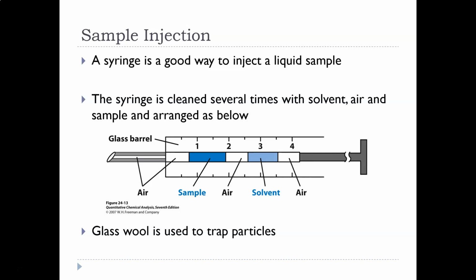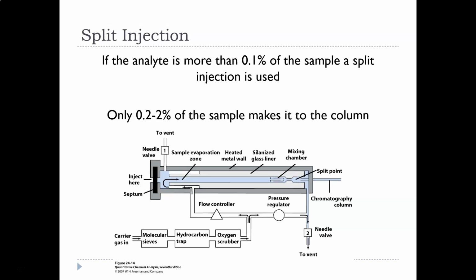Okay, so we have to inject our sample into the gas chromatography instrument. Sometimes we have auto samplers, which are set up attached to the syringe. So you use the computer to tell the instrument what sample to put in and how, and it does that. Sometimes if it's old school, you just have to yourself suck the liquid up with the syringe, poke it in a little port, push the syringe down. With injecting our samples though, because gas chromatography has an open tubular column, that means we need to have a low concentration of sample because there's not very much stationary phase. So we need to have a very low concentration of sample.